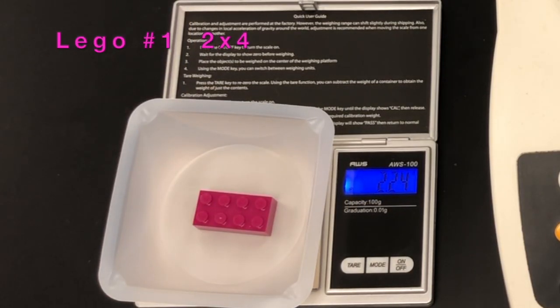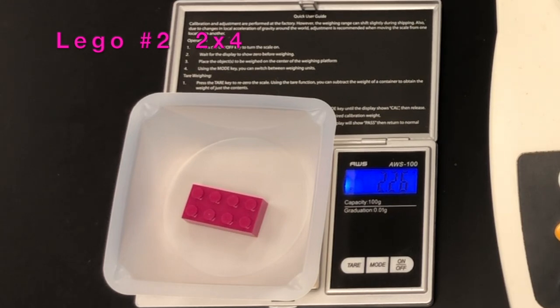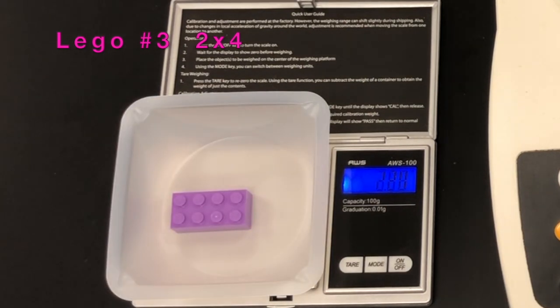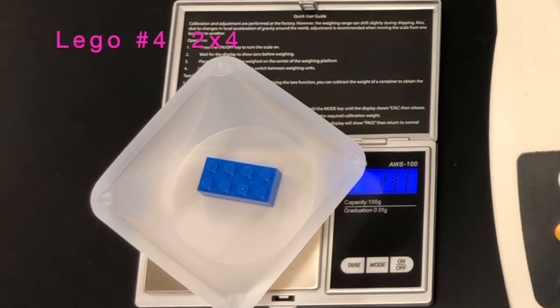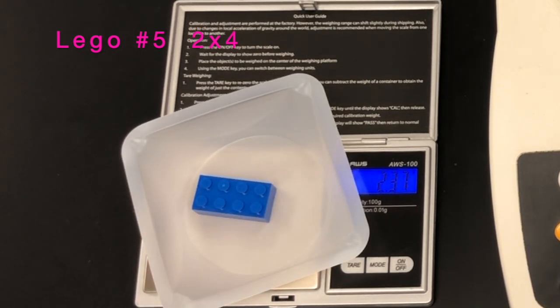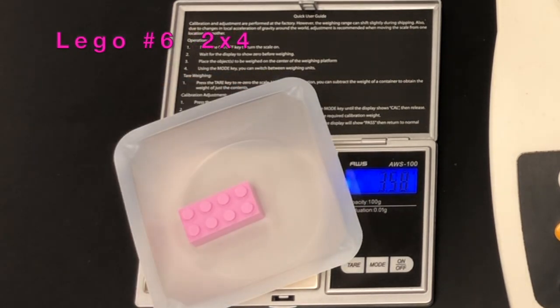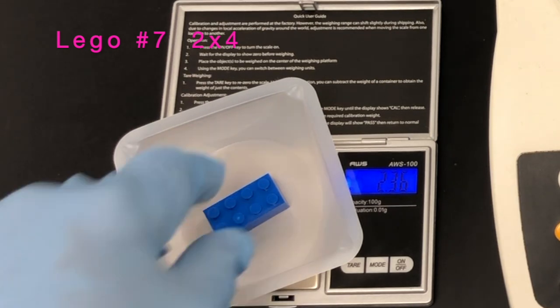This part of the procedure covers the weighing of the two-by-four bricks — these are brick E for eight pegs. As with the two-by-two bricks, you will see bricks one through ten individually. Pause the video and record each mass, add them up, and compare to the combined mass. You will need the average mass of both a two-by-four and a two-by-two brick for the calculation.